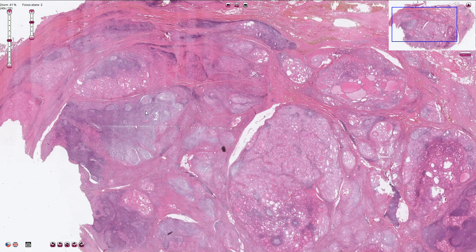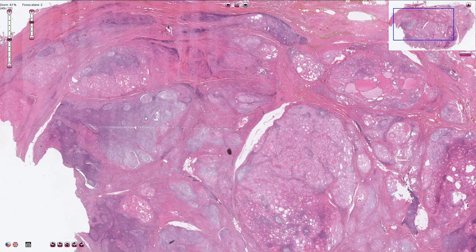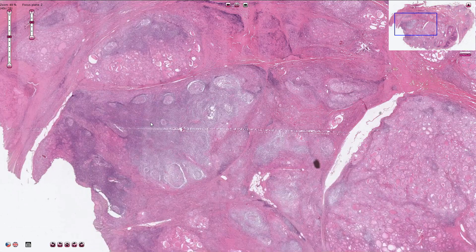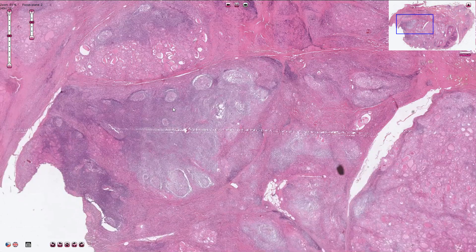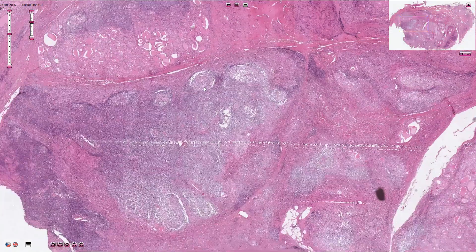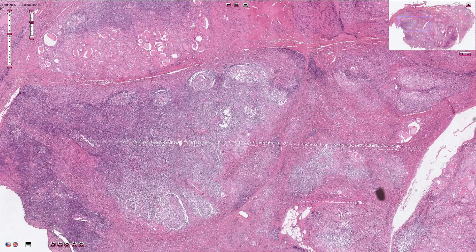Here, the darker areas are lymphocytes, and we can even appreciate follicles with activated germinal centers. Germinal centers are these lighter areas inside of the follicles.